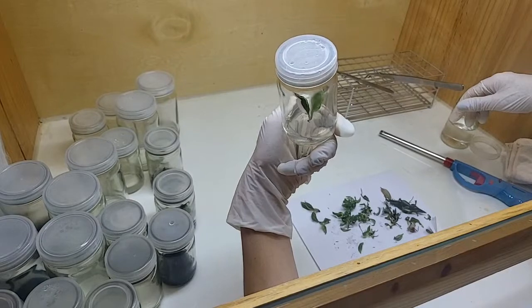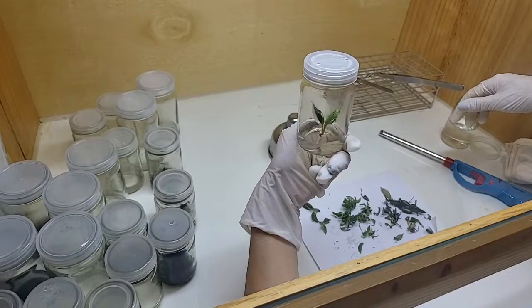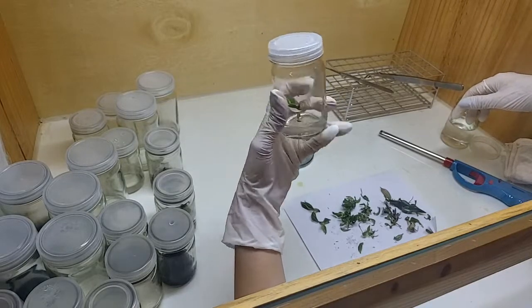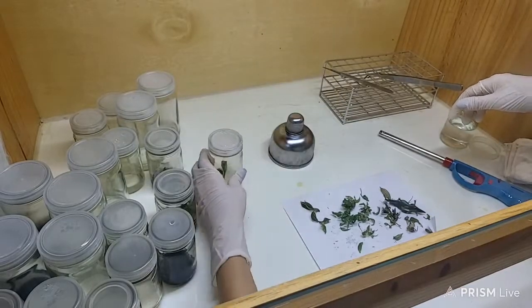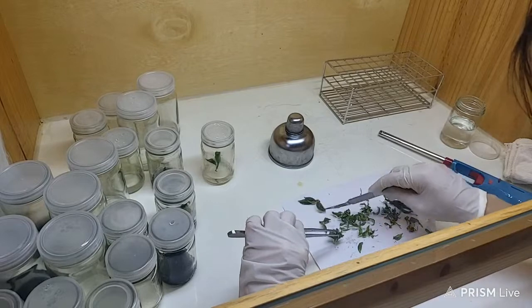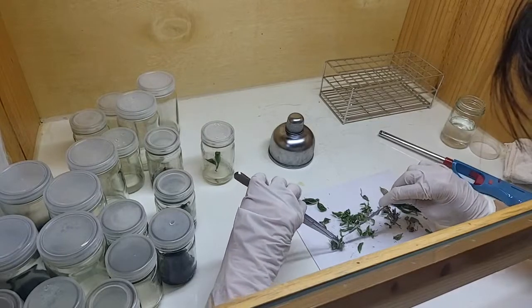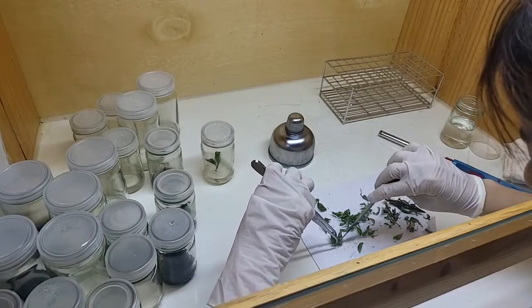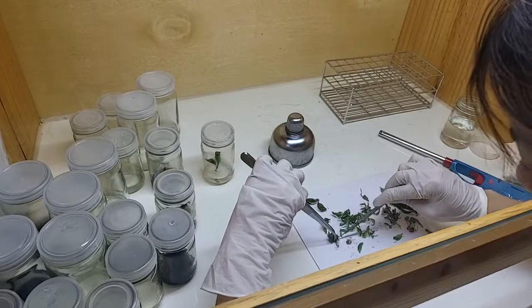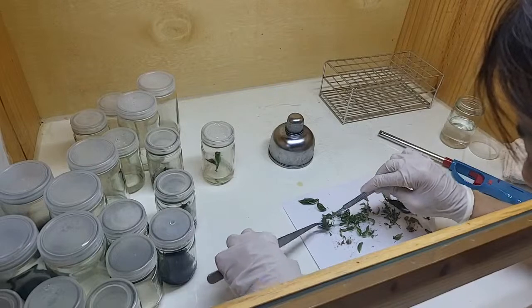One reason we need to move them to a newer food is that about 20 to 30 days they will fill up the jar, and also the food will kind of run out — they'll have very little food. Then all the old leaves are going to die off, and it's not good inside; it has a higher chance of getting contaminated. So we have to get them into a new, fresher food for them to grow in.